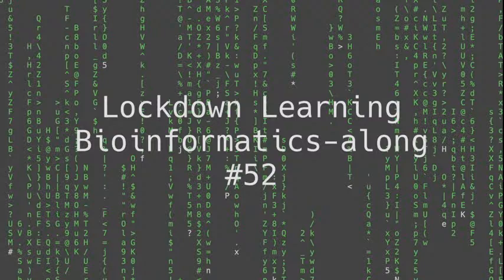Today we're going to talk about workflow management. We're going to look at a workflow management system for bioinformatics, which has been built with bioinformatics in mind, but we're just going to talk about it generically today. And that is Nextflow. There are lots of workflow management systems out there.